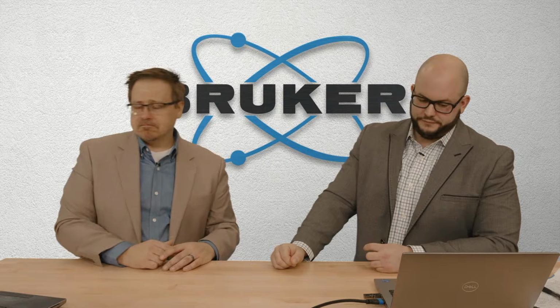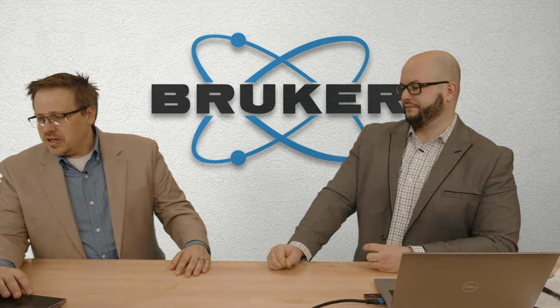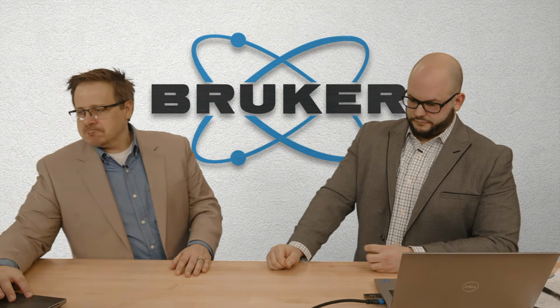Yeah. All right, from JF, how does the software calculate the hydrostatic stress?